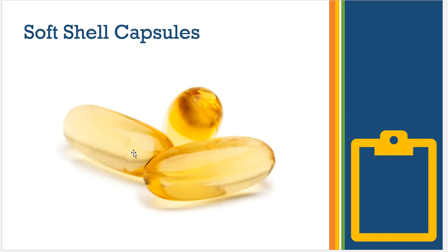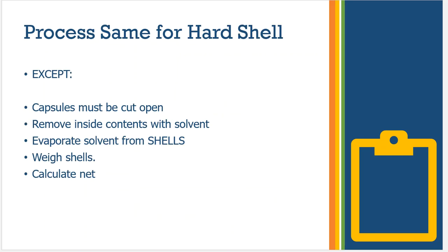You're going to have to squeeze out all of the inside material. Well, no, we're not going to be squeezing, because we can actually break or disturb the capsule in some form or fashion. So what you're going to find out is that we do have to remove the inside, but we're not necessarily going to do that by squeezing the capsule's juice out of it. We're going to use a proper solvent.